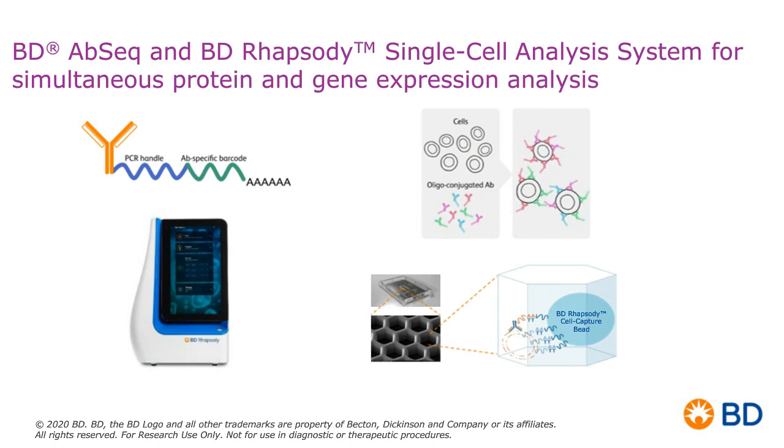So if there's 40,000 molecules of CD4, we'll catch 40,000 antibodies. Well, maybe it's not a direct correlation, not exactly 40,000, but it's pretty close. Once we're able to capture this information, we can send it downstream through a sequencing process, similar to what you would be doing with single-cell mRNA, but now you're getting all of this protein information simultaneously with all of this mRNA information. Genomics approach.